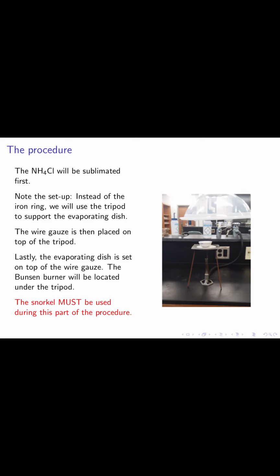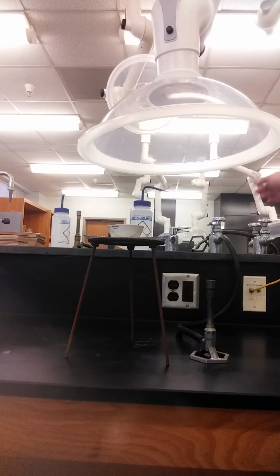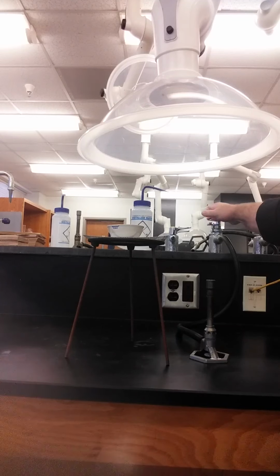It is important that the snorkel must be used during this part of the procedure due to the ammonium chloride fumes that will be generated. We can now ignite the burner and begin the sublimation process.